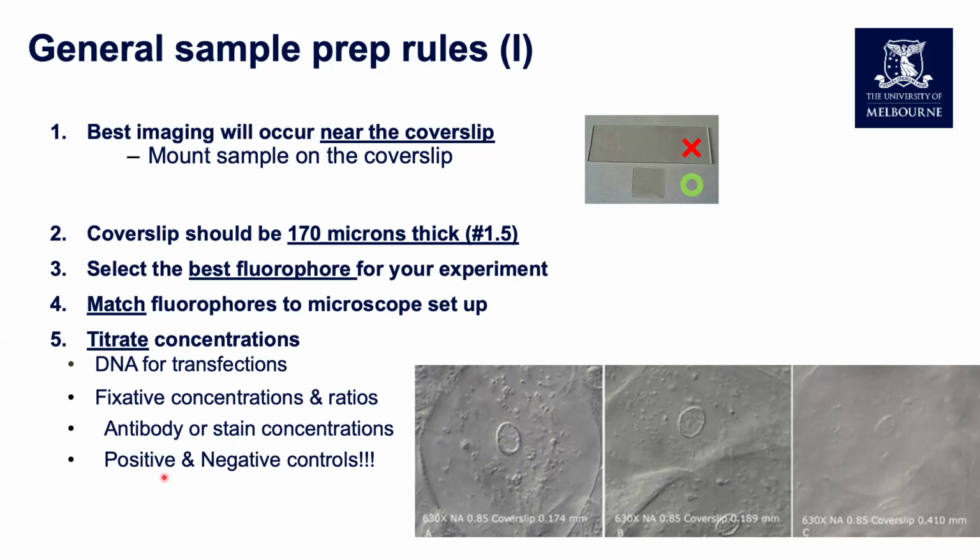And one really key important thing is, especially if you're setting up an experiment from scratch, make sure to include positive and negative controls within that. That's a really vital experiment to do if you're doing a research thesis.